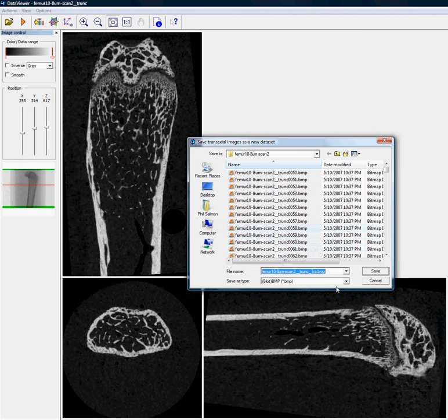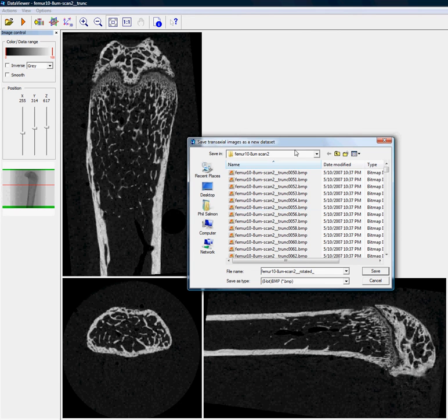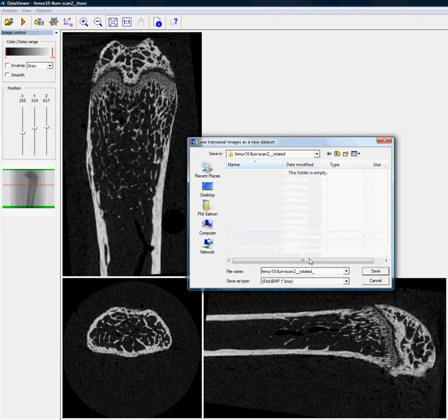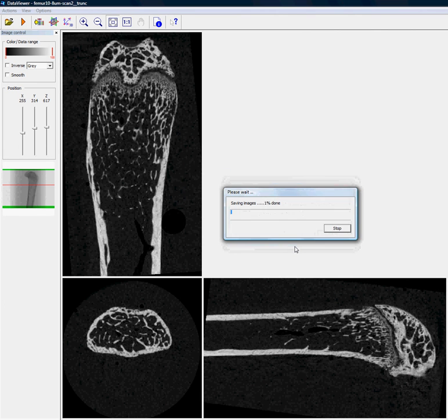And then we just choose a new name for the dataset, let's call it Rotated, and let's also place it in a subdirectory and save a new dataset in the usual way.